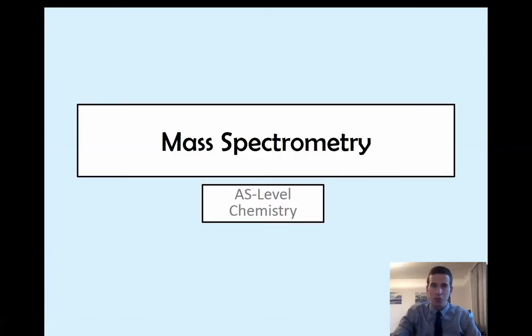Welcome back. So we're about to start the third section in this flipped AS chemistry classroom. Okay, and the first video in this section is going to be on mass spectrometry.